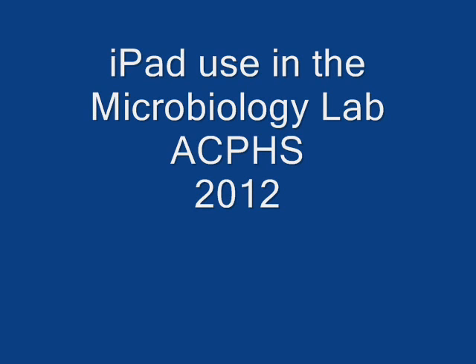The considerations when developing this project were to, number one, reduce the potential of contamination of student materials such as notebooks, laptops, and cell phones in the microbiology lab, and two, to maintain the ability of students to view the labs and to take notes on those labs, and number three, to increase the types of data the students are able to capture and take out of the lab because microbiology relies heavily on the visual interpretation of the data.